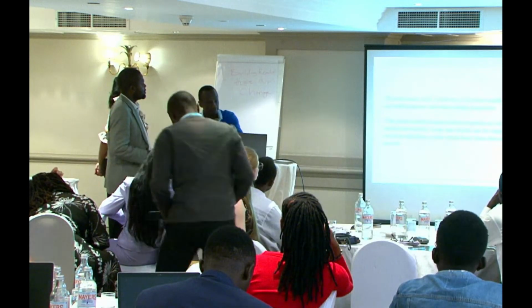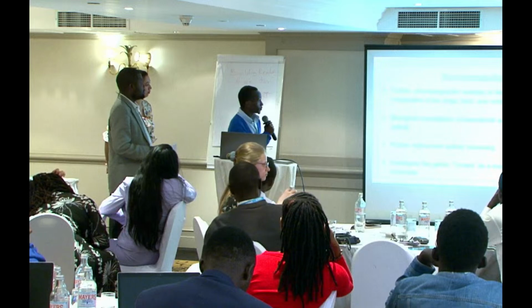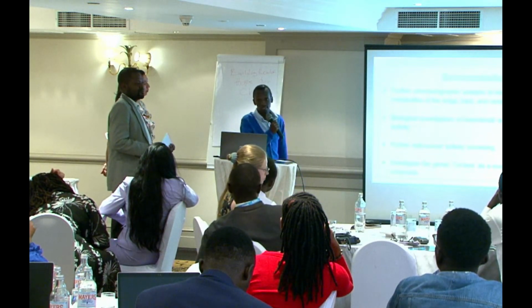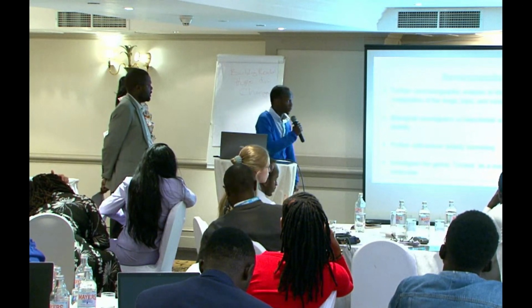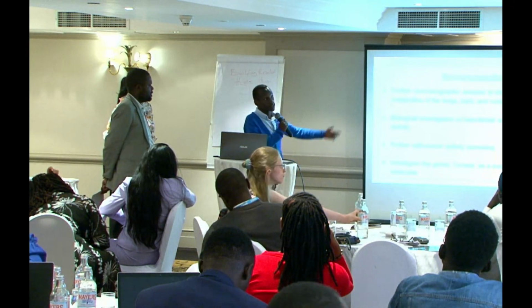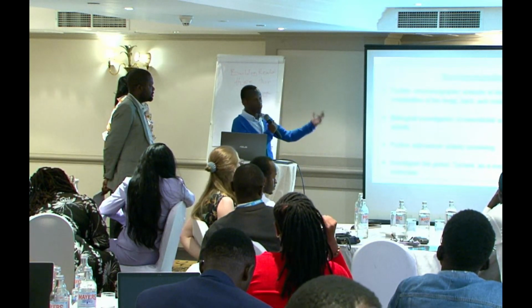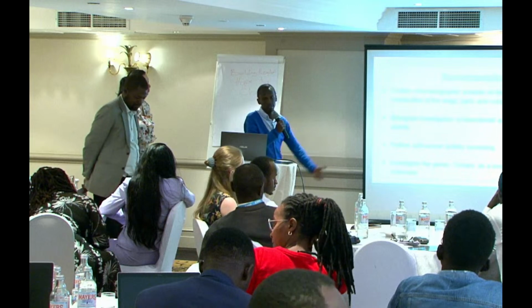So, what is our recommendation? As you saw, we have some peaks, we have compounds for which we did not really identify them. So we can also extend the study to the roots. We can do replicates on the bark, as you saw, one of our experiments backfired.